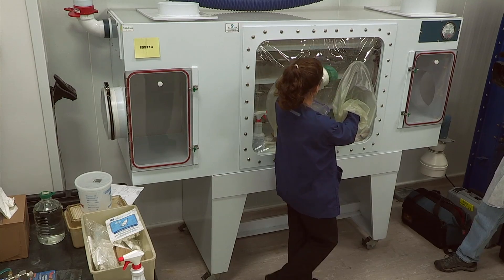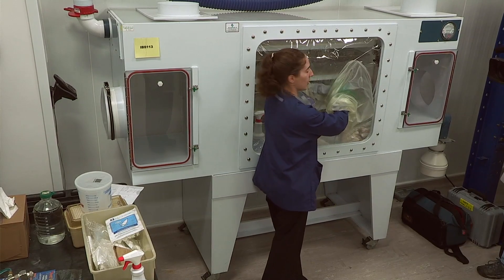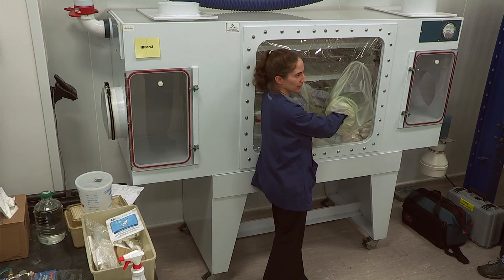On these isolators there is a way to clamp off the sleeve and change the glove with the isolator still in place.